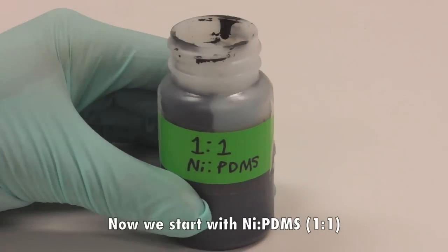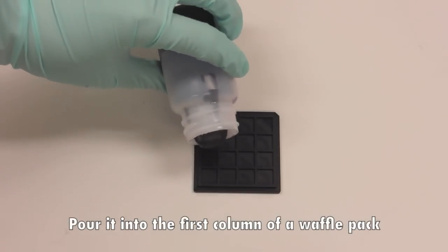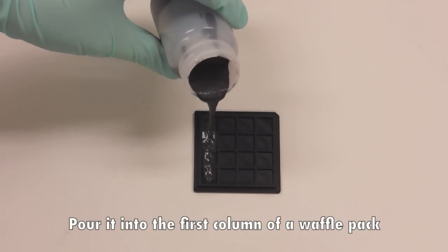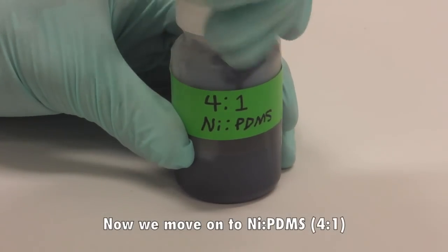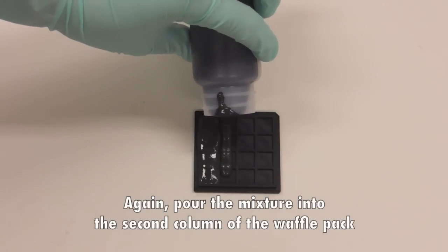Now we start with nickel PDMS 1-to-1 — pour it into the first column of a waffle pack, wait for a couple seconds, and make sure it spreads out evenly. Now we move on to nickel PDMS 4-to-1; again pour the mixture into the second column of the waffle pack and wait for a couple seconds.